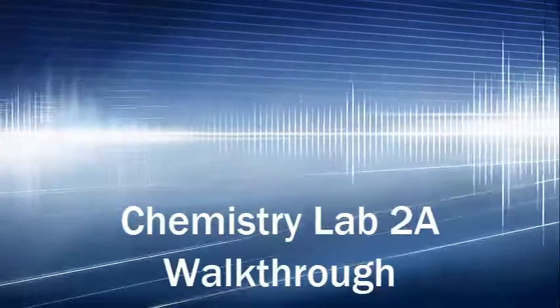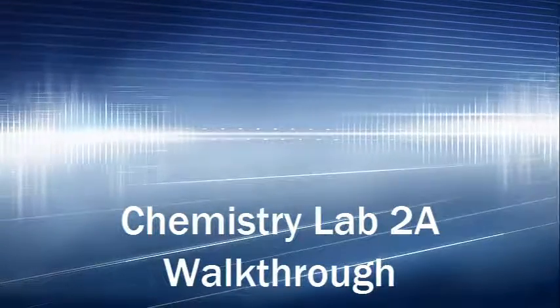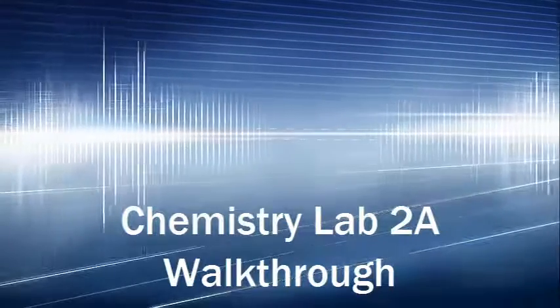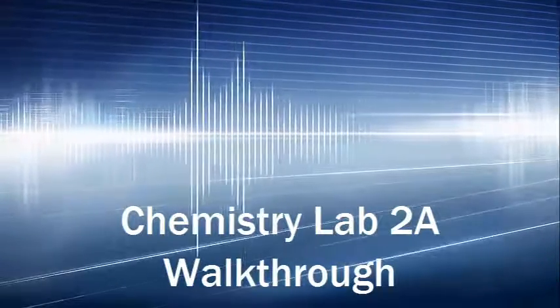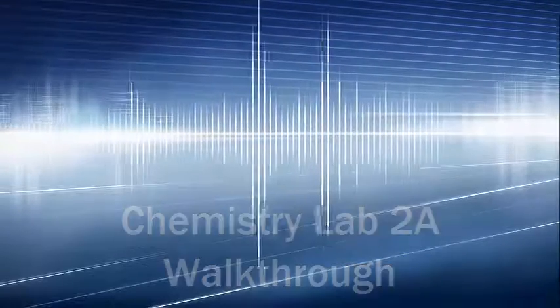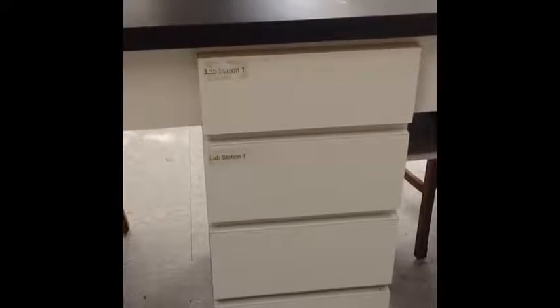Welcome to the Chemistry Lab walkthrough for Lab 2A, using differences in physical properties to separate a mixture. In this lab we will separate a mixture of salt and sand and find the percentage of salt and sand and the percent recovered. When you arrive at the lab, proceed to your lab station.